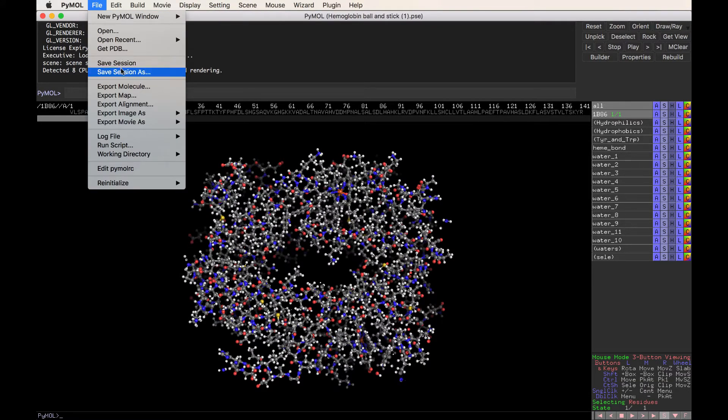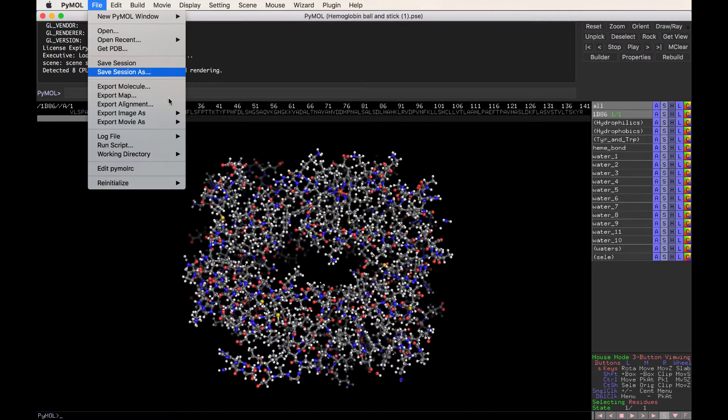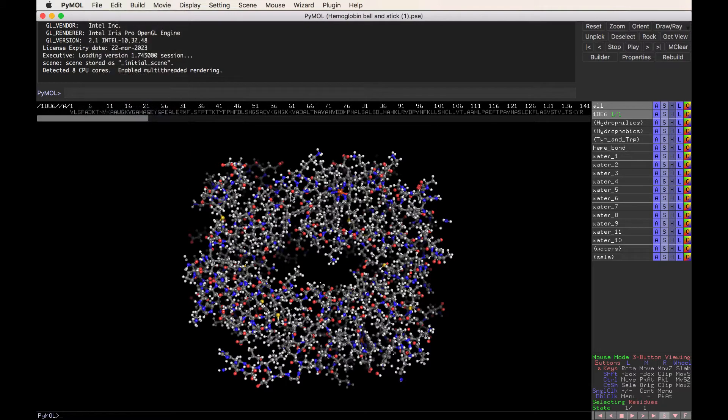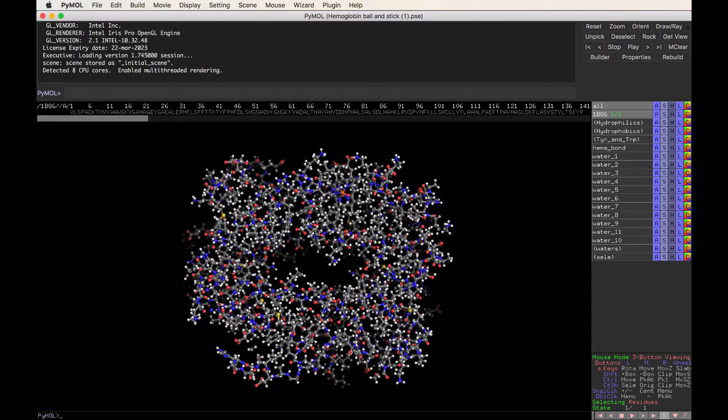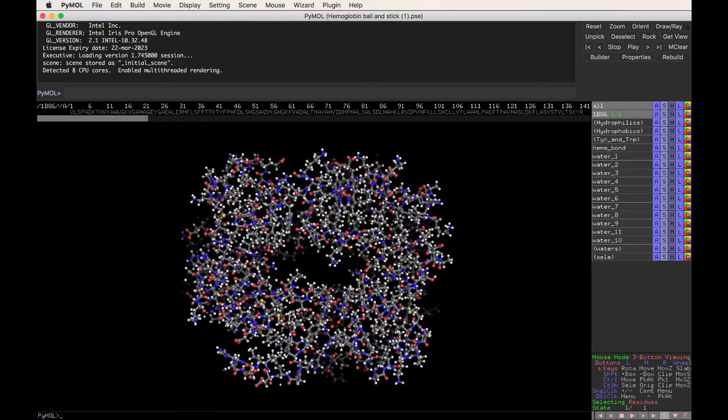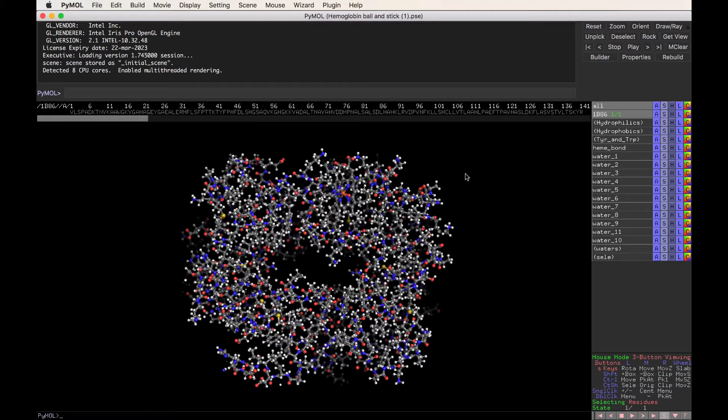So I also recommend saving your session often. Go up to here, file, save session as, and keep a saved version of whatever you're working on at all times so that you don't have to repeat what you've done already. Now I have many videos on my YouTube channel that explain more about hemoglobin and more about how to use PyMOL. But in this video, I wanted to just give you a few of the basic commands to give you a feel of what PyMOL can do.